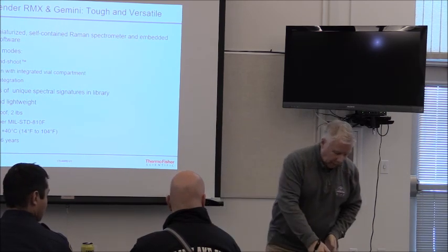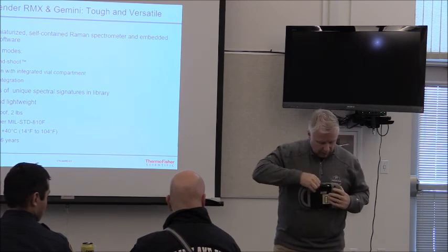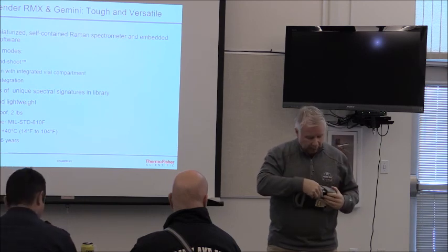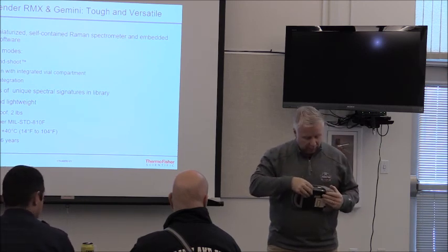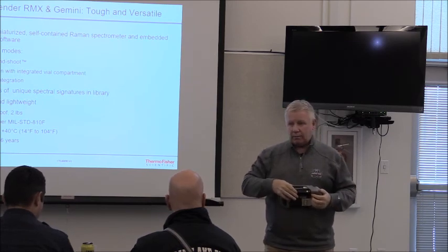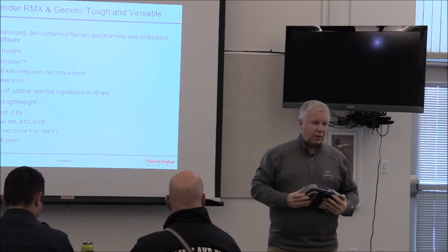And the same thing will happen on the Gemini. When you rotate that around, it goes inside there, and that little band goes away. I pull it back a little bit and leave it like this. Normally on the Gemini, if you pull it back, it just comes off. If I see the band, no bueno. Snap it into place or lock it into place, and the device is good to go. You have the correct focal point.